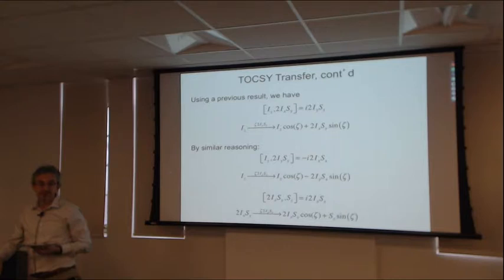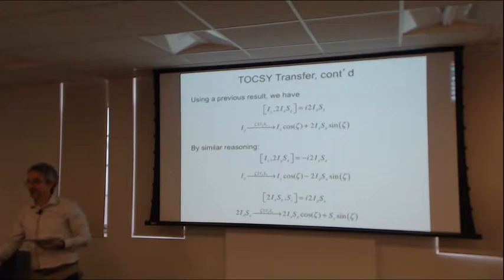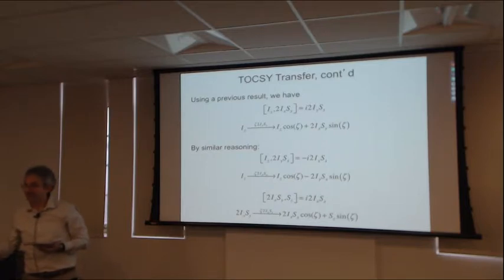And you can see the problem. The chemical shift difference, say between the H alphas and NHs, is about 4 parts per million. On a 500, that's 2,000 hertz. 1 over 2,000 hertz is half a millisecond. So we have to apply pulses much faster than half a millisecond. And this was done in the early days.